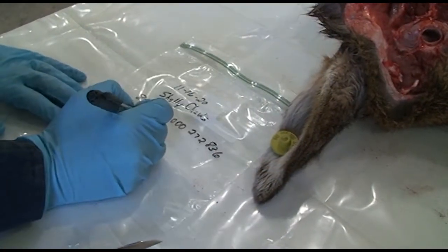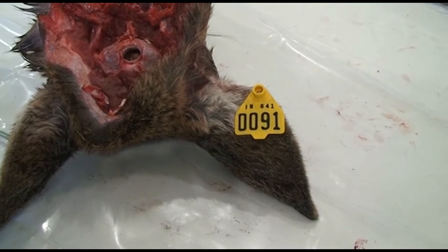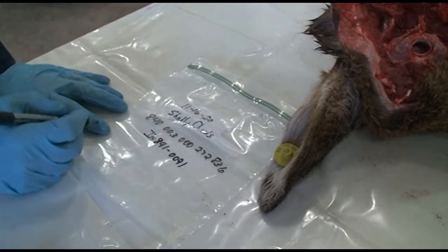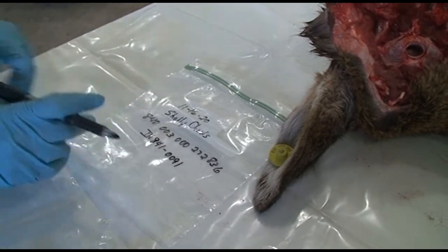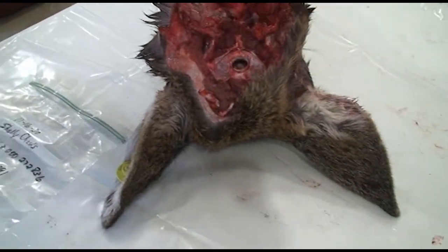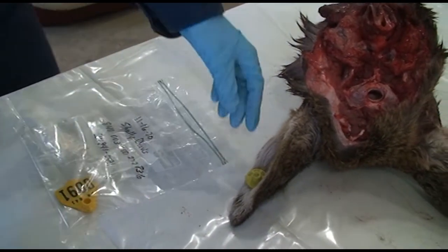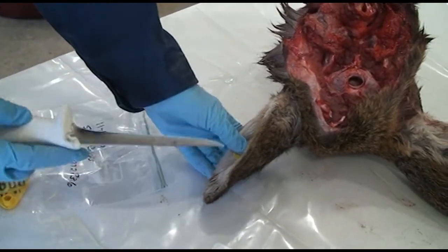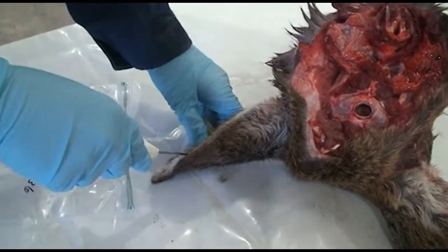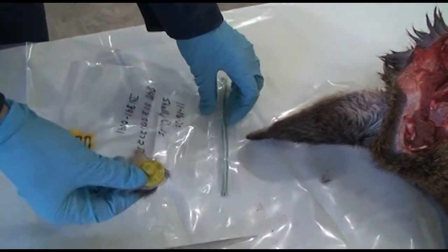And then the farm tag, those tags have an Indiana cervid herd ID, the IN 841 dash, and then the bigger number we put a dash, and then that's an individual ID, and that would be the farm tag. And so we want to write all the IDs down, but we only have to take a piece of ear tissue with the official ID. So this tag would go in the bag. And then our official tag, and these are wild deer heads we're practicing on, so the tags are not attached, but we're going to pretend that they are. And we're going to cut a piece of ear tissue around the tag, and then that also would go into the bag.